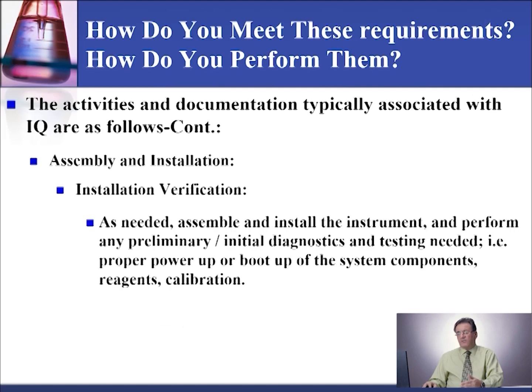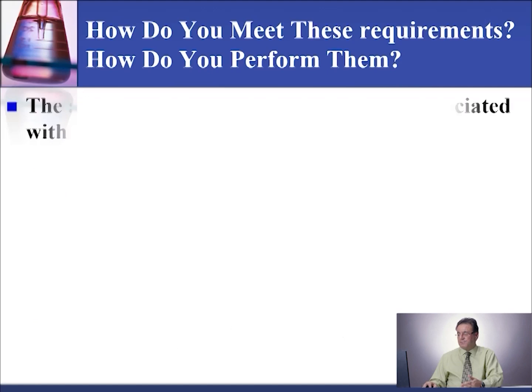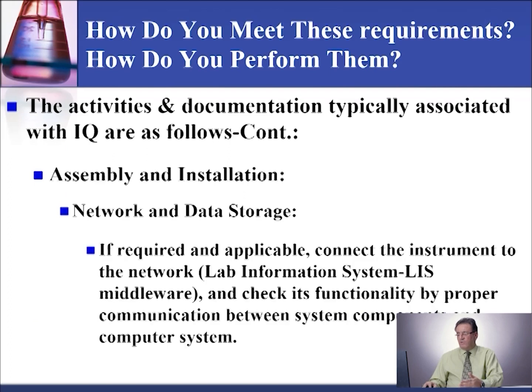Now, how long do you keep your performance verification record for? As applicable, the result of the performance qualification could be recorded on the qualification form or report, must be signed by the medical director or designee, and must be kept on file for as long as you keep and use that instrument or equipment, plus 2 more years per CAP, 3 more years per CBAHI for the general lab, and 5 years for a blood bank per CAP and CBAHI.